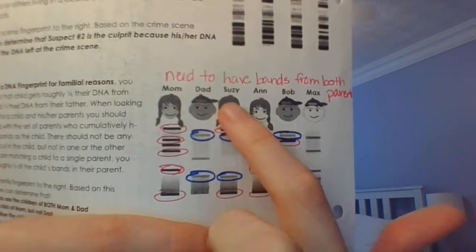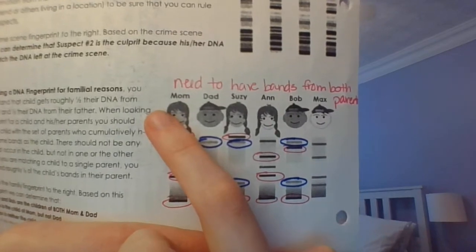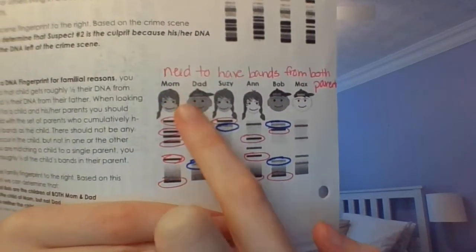Okay, one more time. Susie is the child of both. Anne is only the child of the mother. Bob is the child of both, and Max is the child of neither. Okay? So that's how you read it.